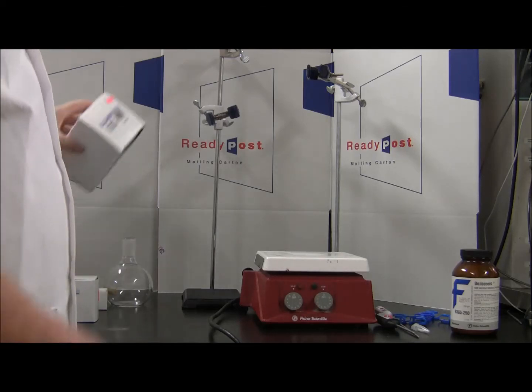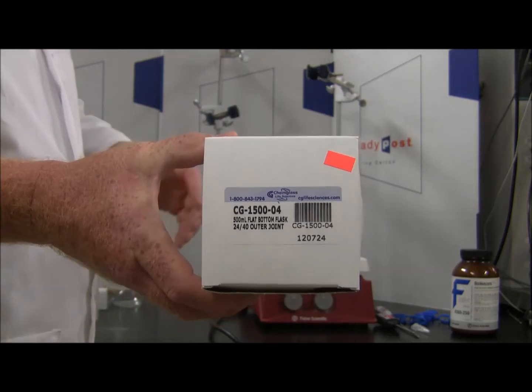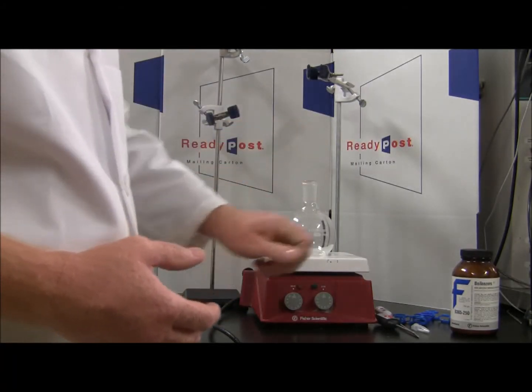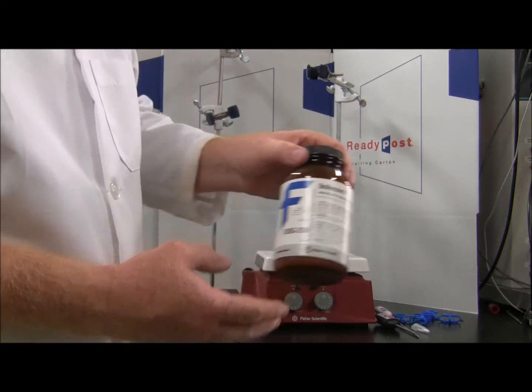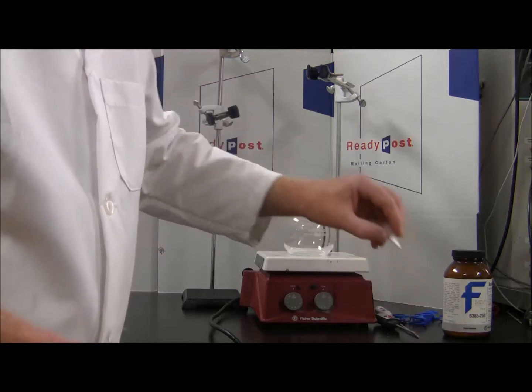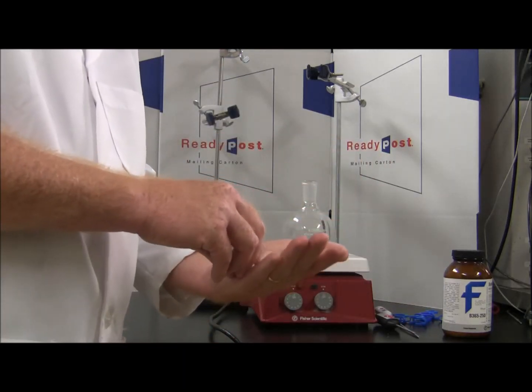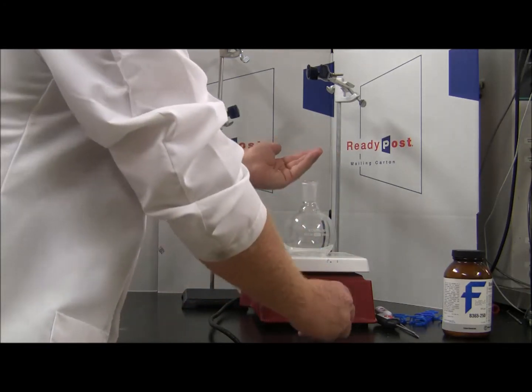Okay. We're going to start out with a 500 milliliter flat bottom flask. Go ahead and put that on the hot plate. Also, we put some boiling chips in. In the kit, they were supplied in a little sample pack like this. There's more than enough to do several experiments. You only need 5 or 6 chips for each experiment.